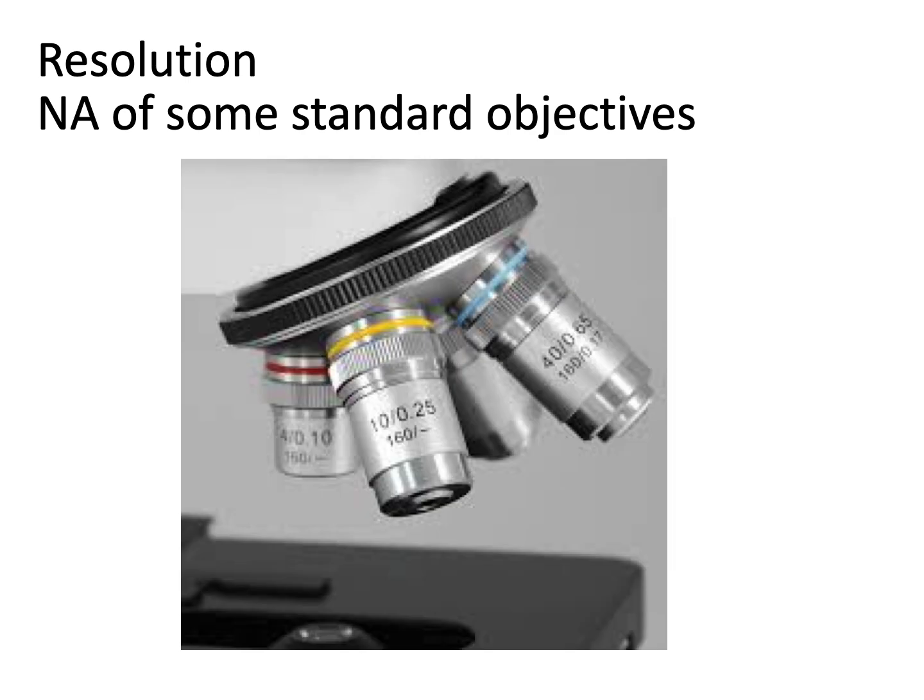And so this is the same picture and panel from one of the earlier slides. You'll notice that they're different lengths, and that's because they're different powers. You can see the different powers written there. I see 4 for the red, 10 for the yellow, 40 for the blue. Those are the magnifications. Now after that, I also see 4/0.10, 10/0.25, 40/0.65.